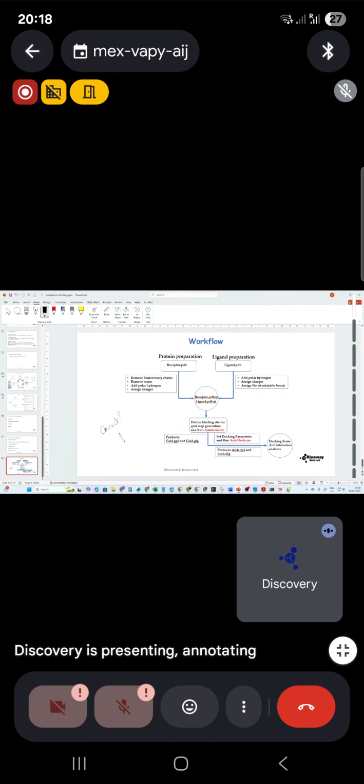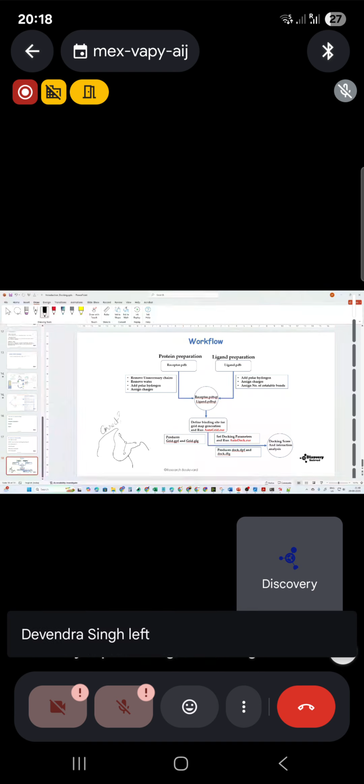Let's say this is the ligand at your active site pocket. This is the co-crystallized ligand, or the drug molecule at the active site pocket. This is experimental. You know that in the real system this pose exists.